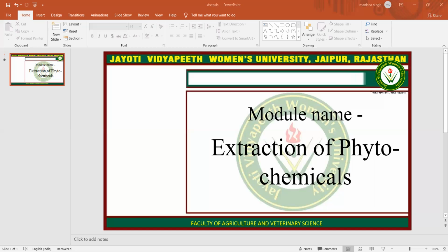From the holding tank, the extract is pumped into a sparkler filter to remove fine or colloidal particles from the extract. Next is the concentration. The enriched extract from percolators or extractors, known as miscella, is fed into the wiped film evaporator where it is concentrated under vacuum to produce a thick concentrated extract. The concentrated extract is further fed into a vacuum chamber dryer to produce a solid mass free from solvent. The solvent recovered from the wiped film evaporator and vacuum chamber dryer is recycled back to the percolator or extractor for the next batch of the plant material.